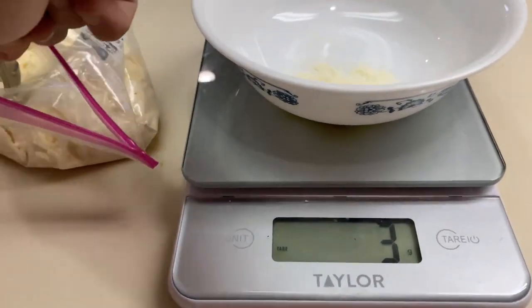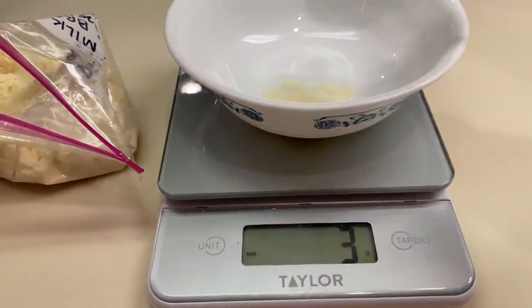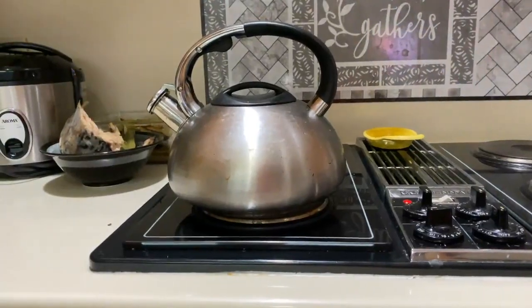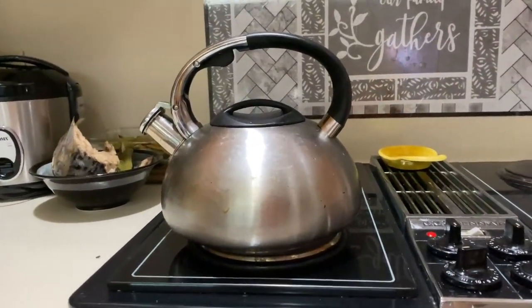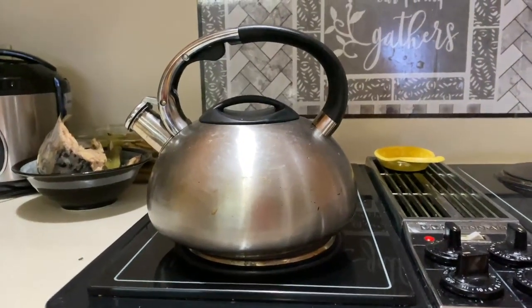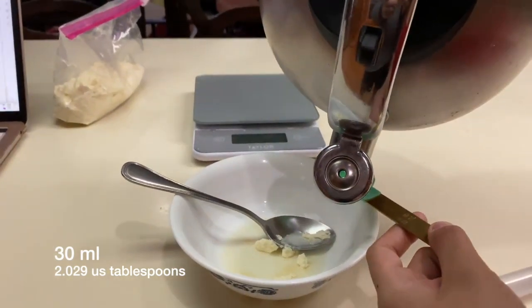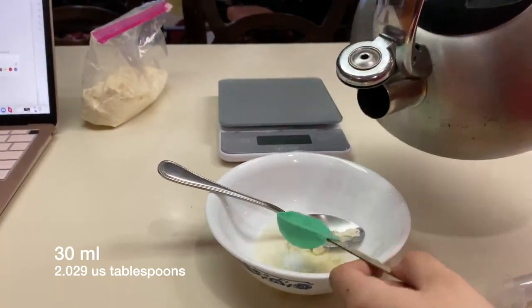Procedure for isolation of casein. Measure 5 grams of whole milk, which is basically two spoonfuls. Ensure availability of distilled water that is heated to 40 degrees Celsius. Pour 30 milliliters of the heated water into the milk and mix.